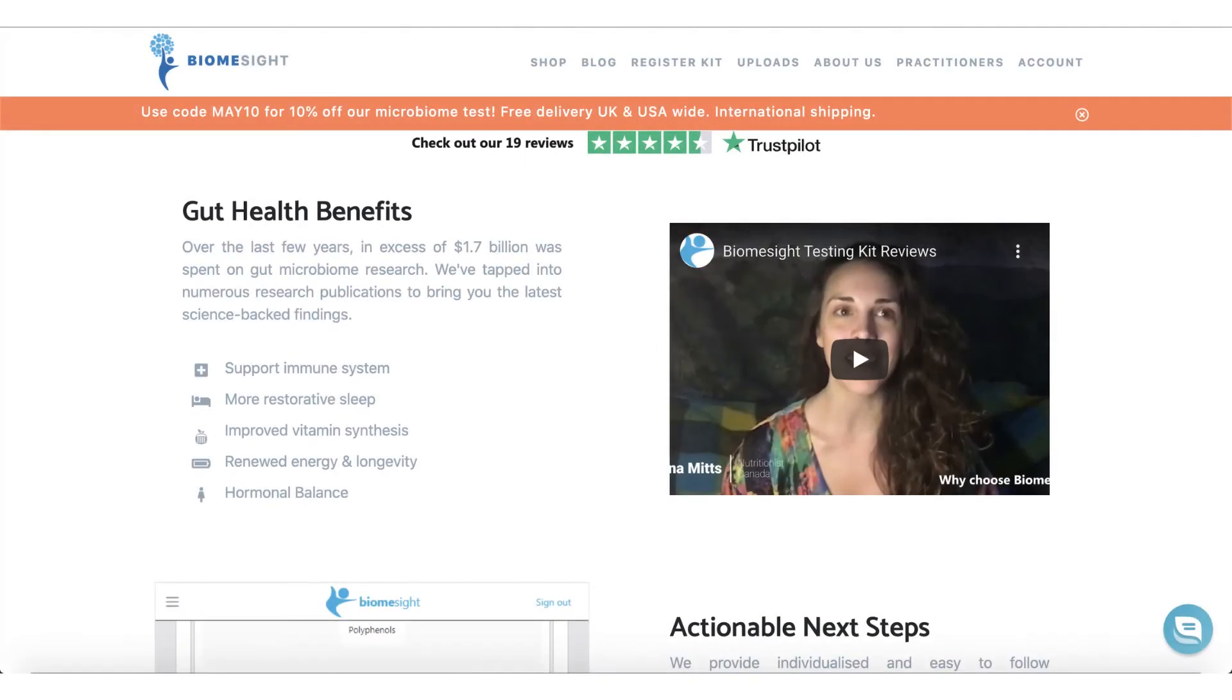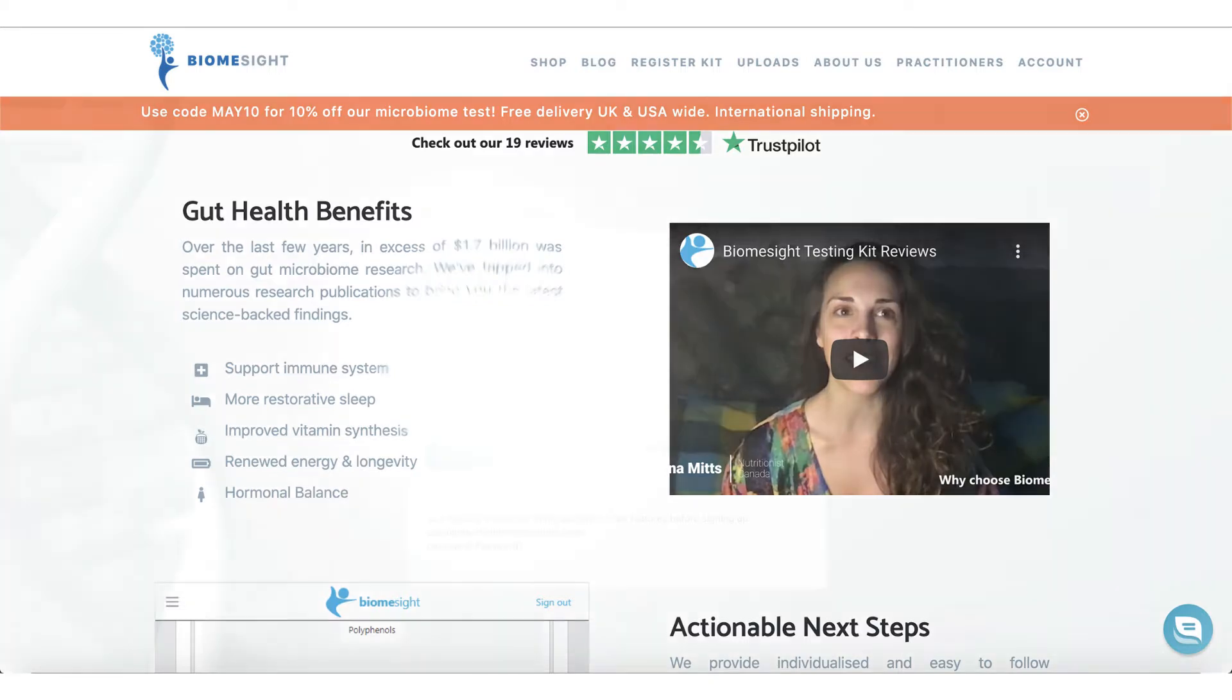Hi, my name is Ted Lawler, Marketing Manager at BiomeSight. Today I would like to give you a walkthrough of BiomeSight test results.